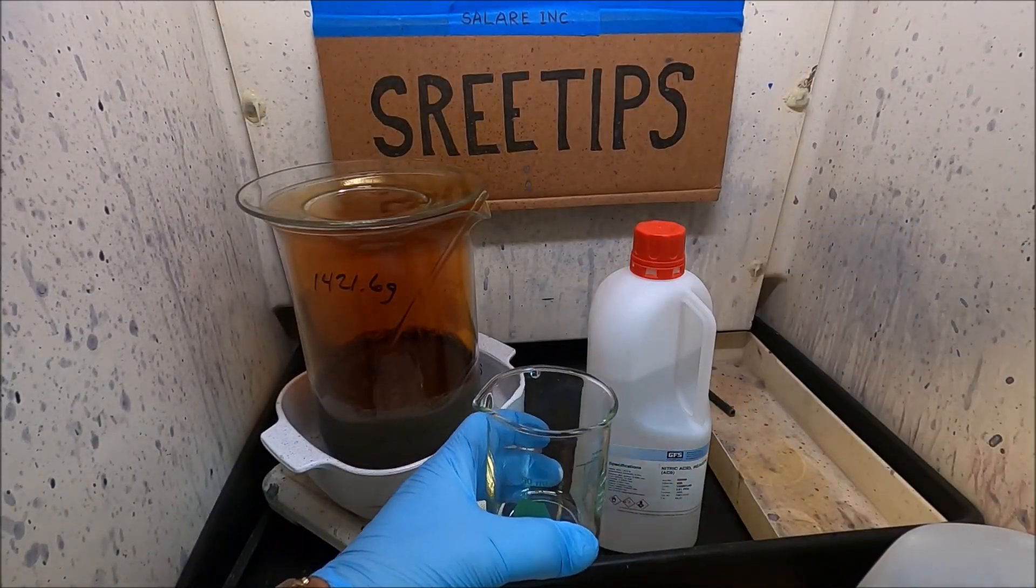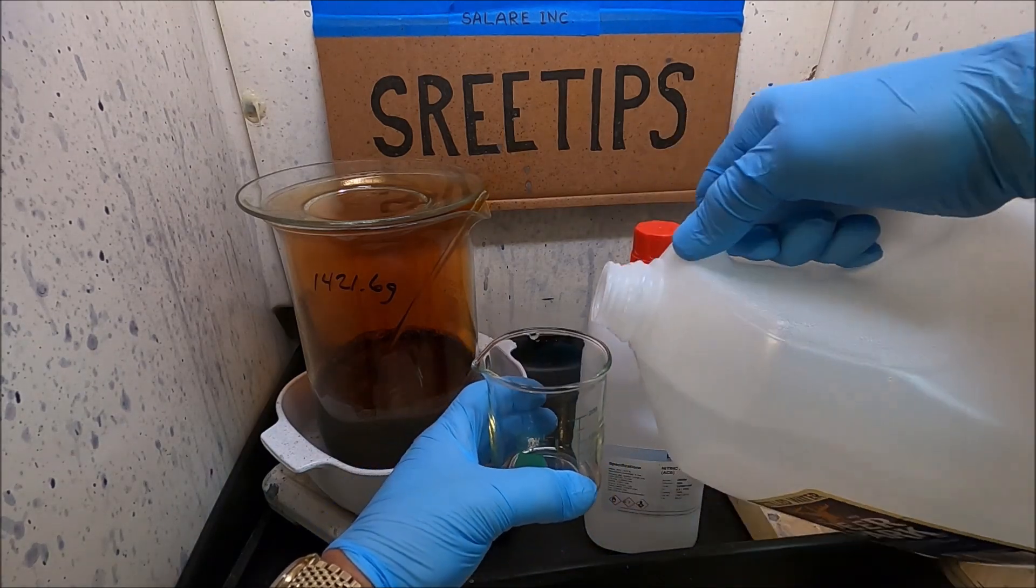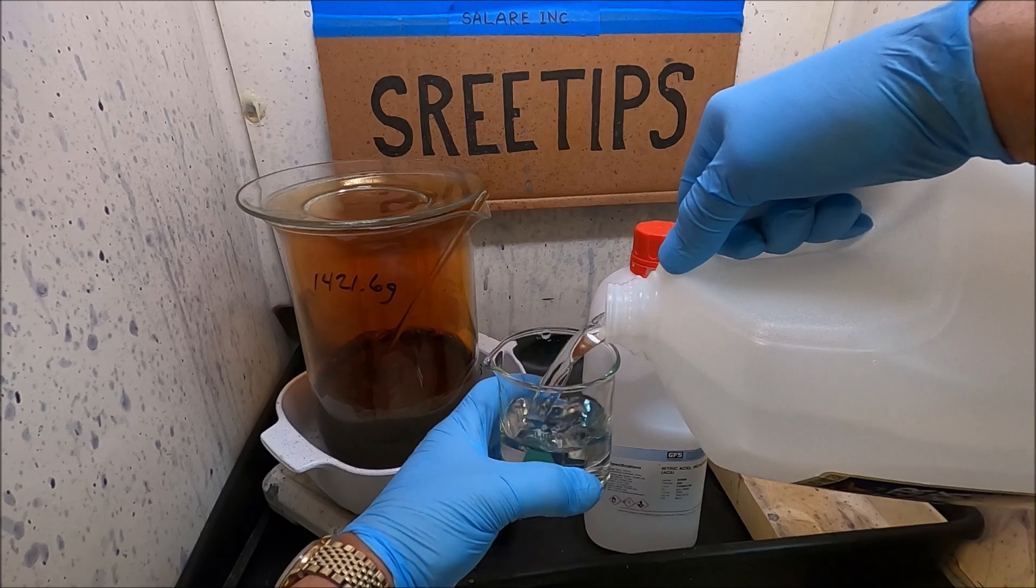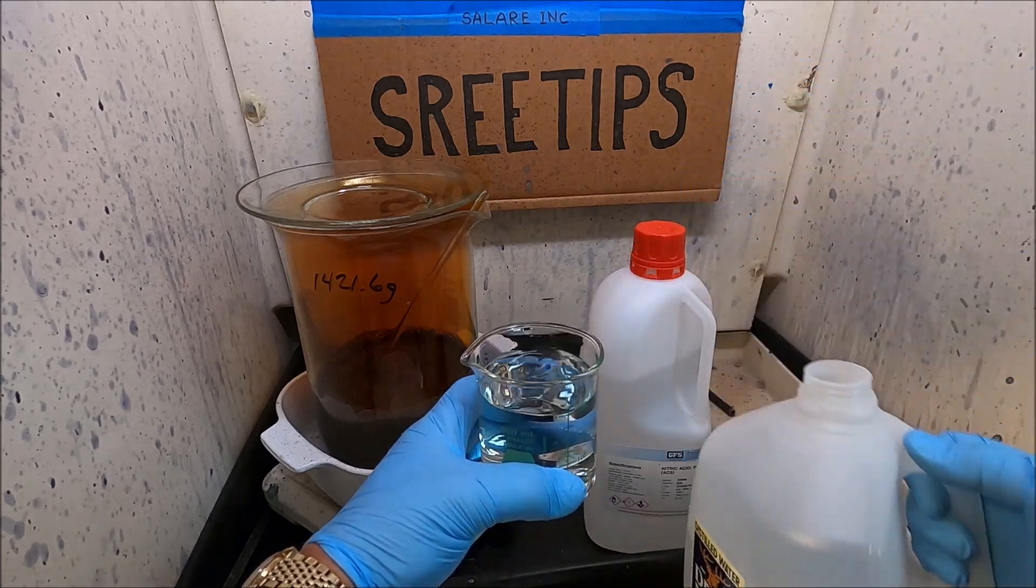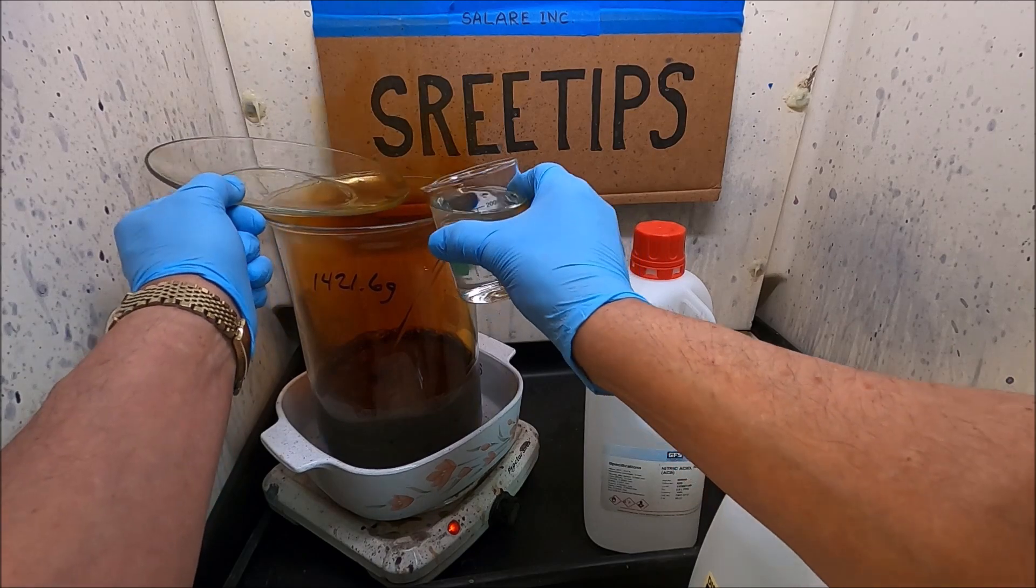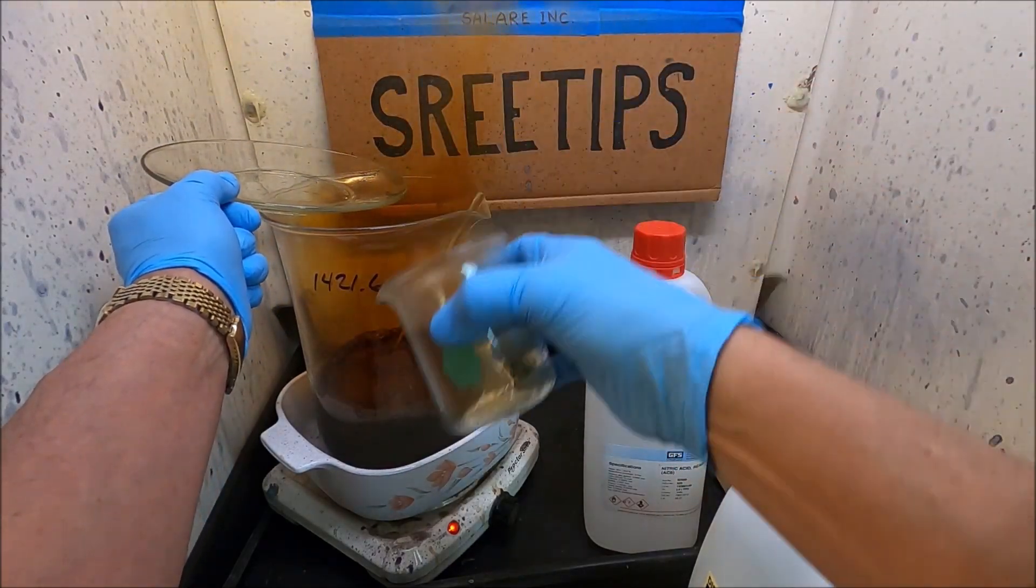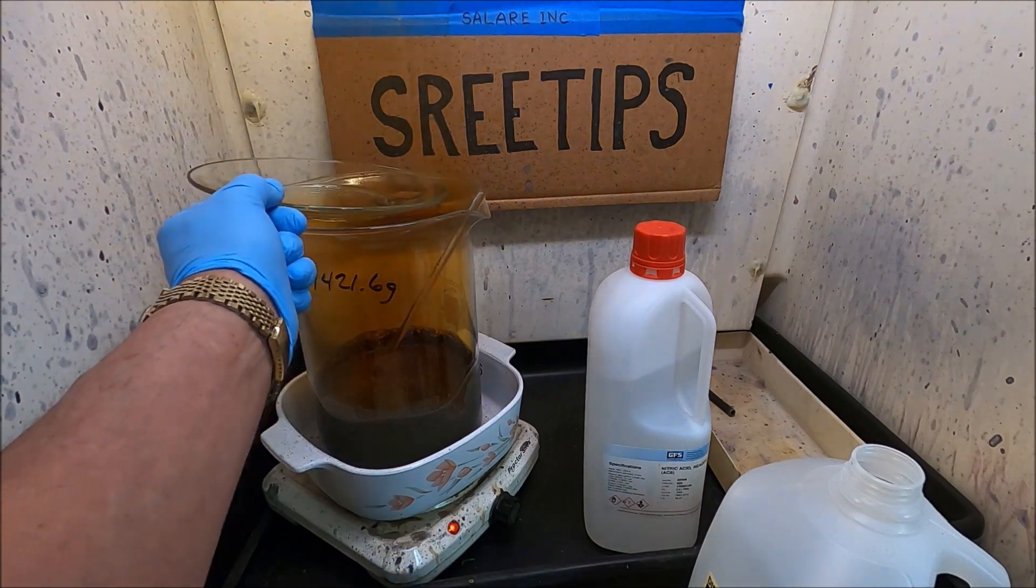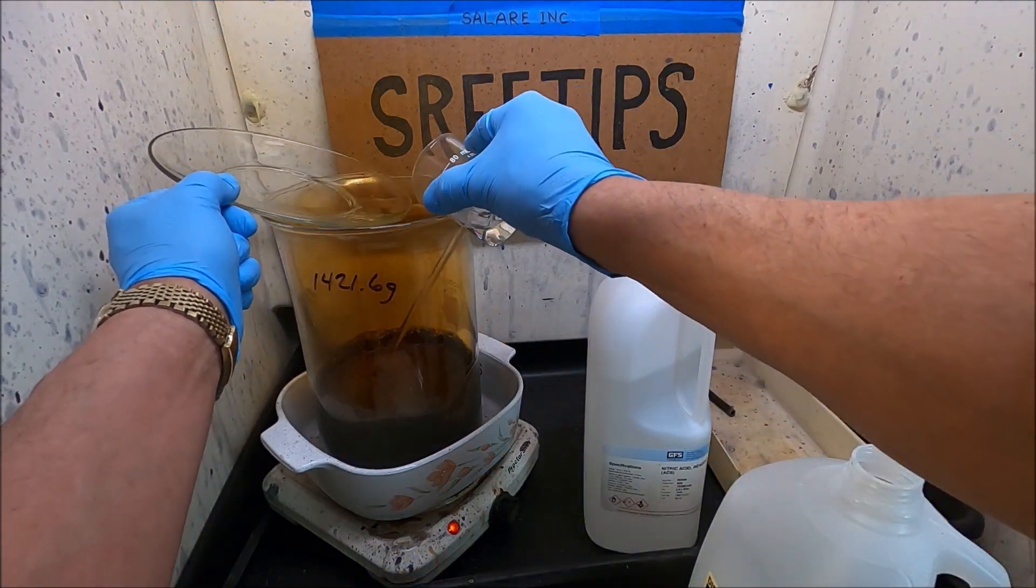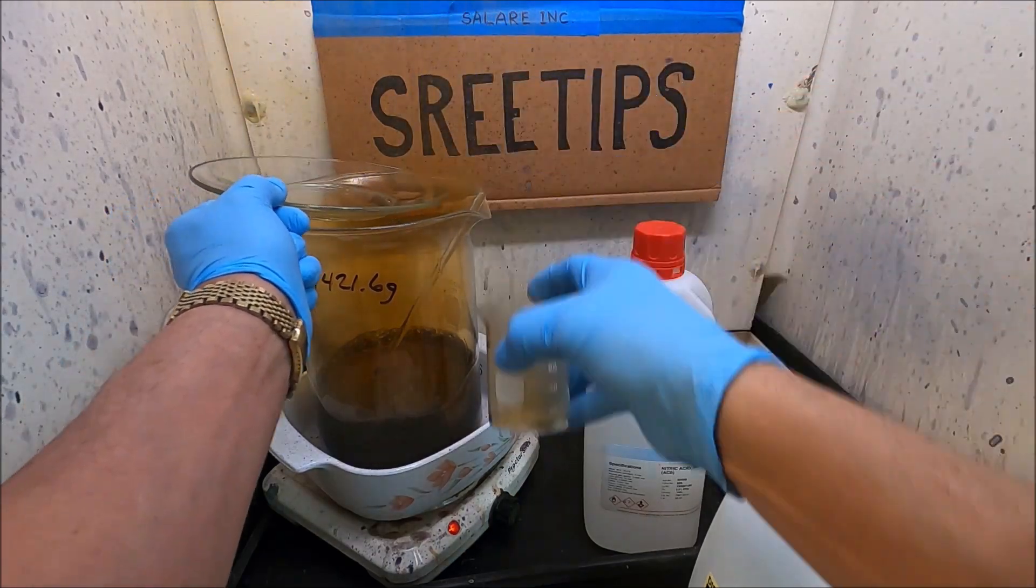Just added that nitric. I'm going to put a little bit of distilled water in, 200 milliliters here, just so we can hydrate the reaction here, make sure we got some place for those metals to go as they dissolve. Now I'm going to add the rest of the nitric here and we'll let this cook.